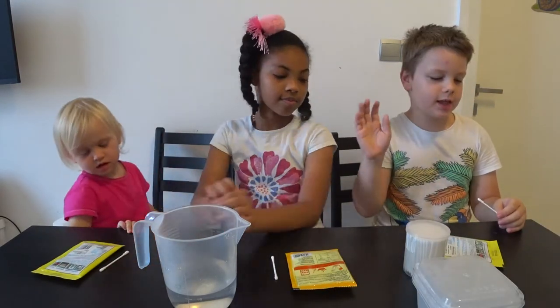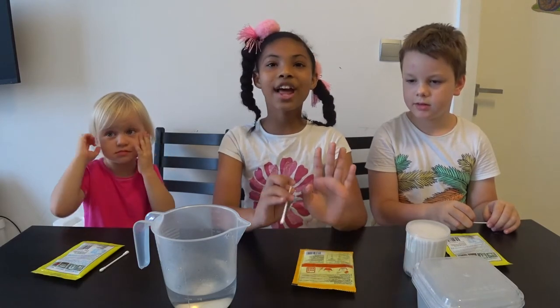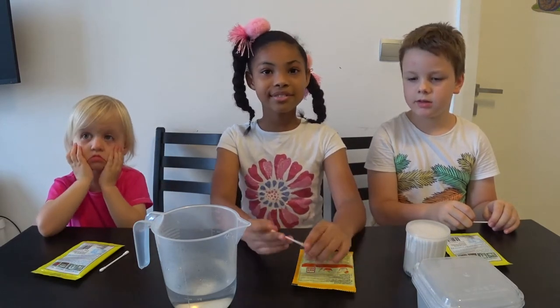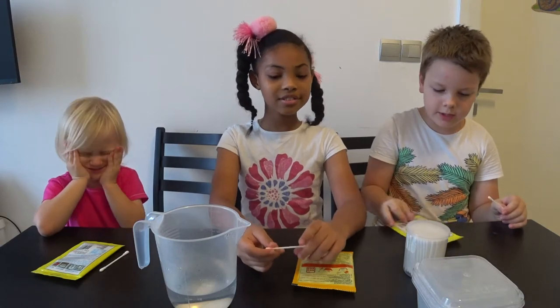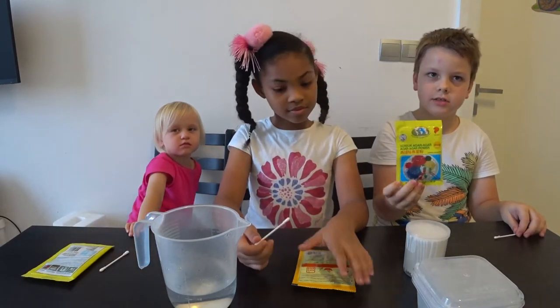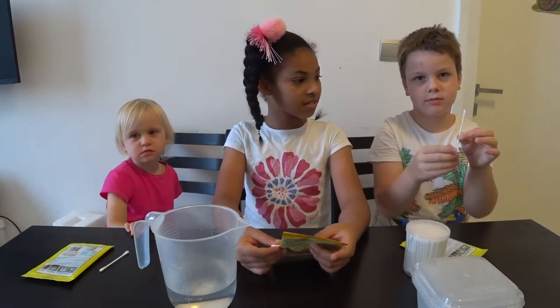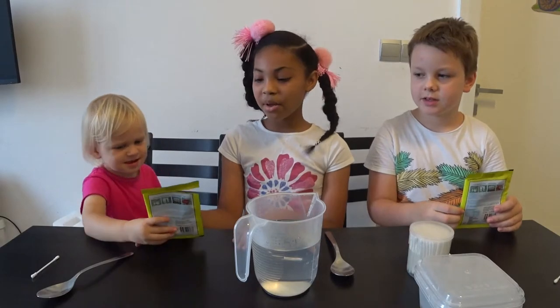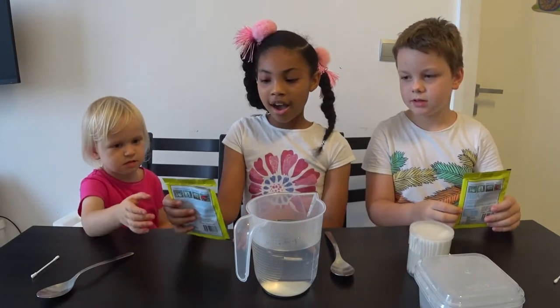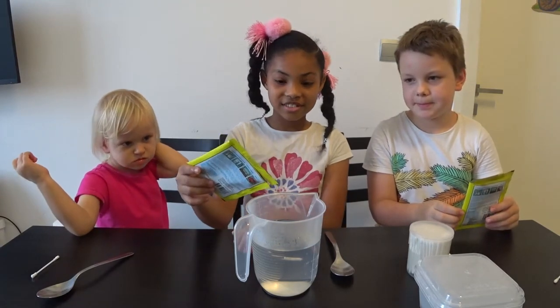Today we are making experiments with germs. We will need 330 grams of water, and we need 10 grams of agar-agar. We will need cotton sticks. Now we're gonna pour the agar-agar into the hot water.